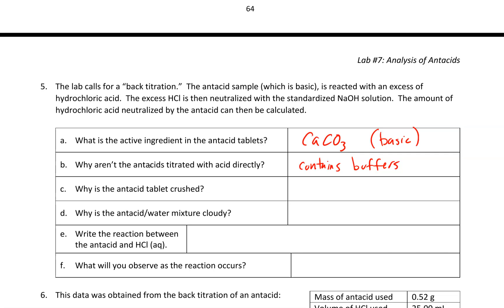Before you use your antacid, you're going to crush up the tablet. Why do you think we do that? If you're thinking, well, that's going to increase the surface area and speed up the reaction rate, you are correct. So increase surface area, increase reaction rates.